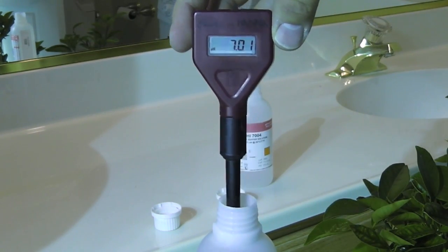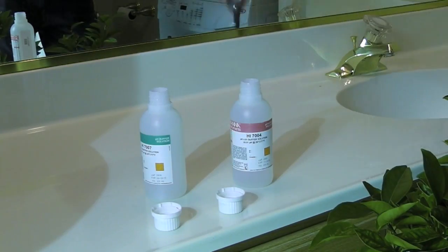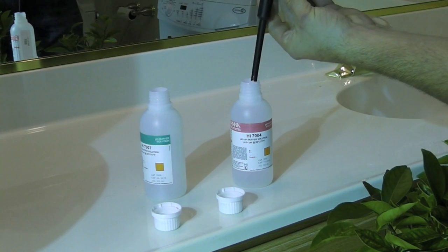Now we'll wash off the meter in some tap water and try it again. And now for the 4.0 buffer.